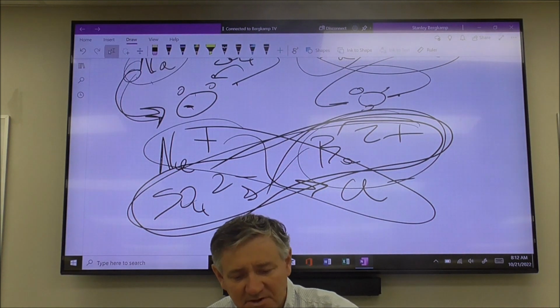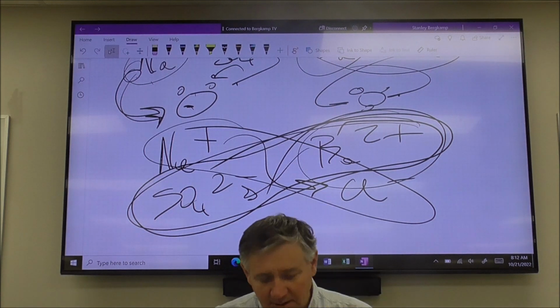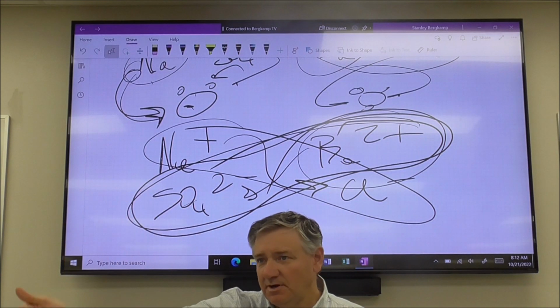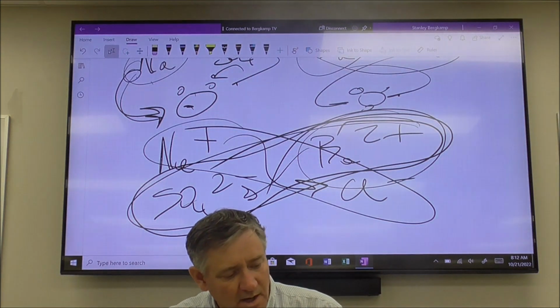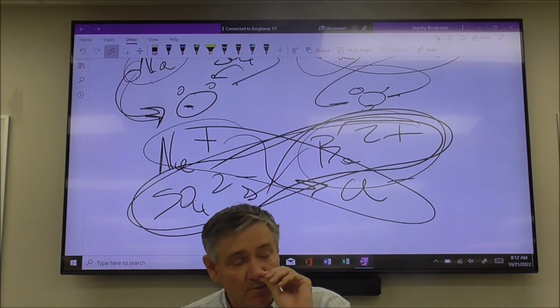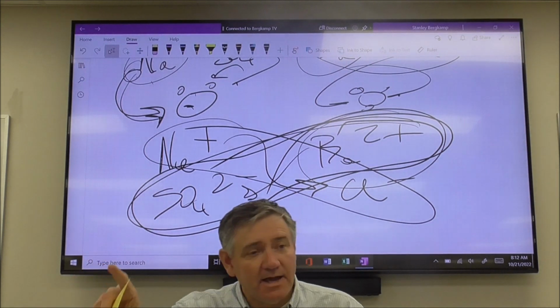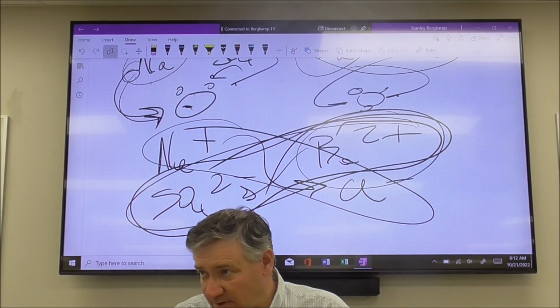Okay, so here's what we're going to do. Go over there, you're going to fill out this data table. Okay? Then what's going to happen is that Luke is going to come up to Ella and go, Ella, hey, pick one of these: magnesium, calcium, strontium, barium. Okay? So Luke is going to take his well plate and give it to Ella. And Ella is going to pick one of the four: the magnesium, the calcium, the strontium, and the barium. Okay?